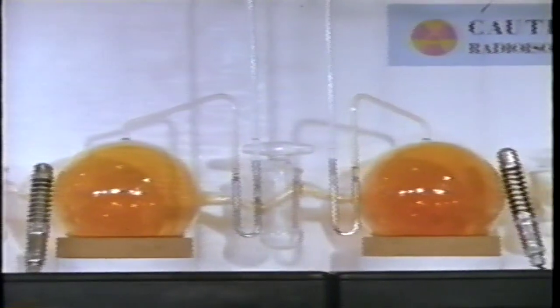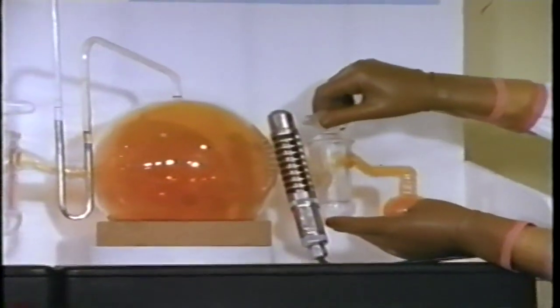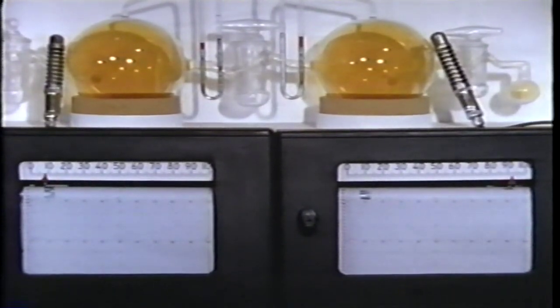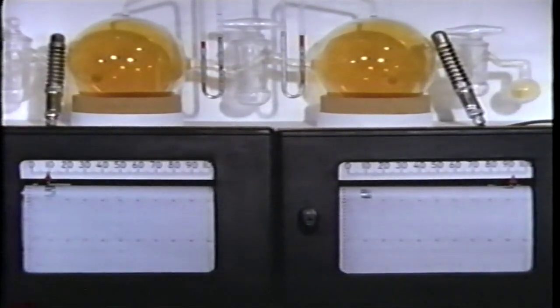Let's allow a very small amount of radioactive bromine to enter the large bulb. Watch the indicator on this right-hand recorder. It shows that radioactive bromine has entered the right bulb. Meanwhile, the left recorder shows only background radiation. Gas color is constant in both bulbs, and the manometers show no change, so we still have pressure equilibrium.